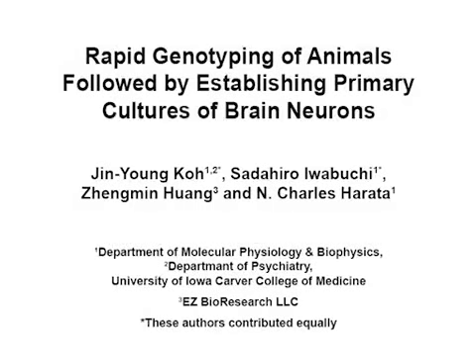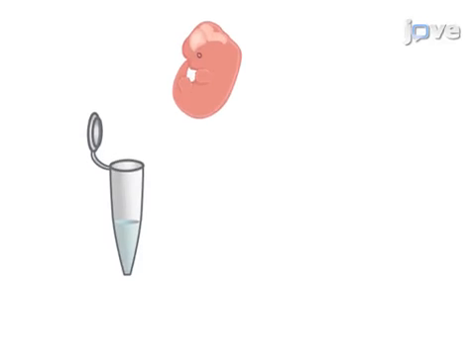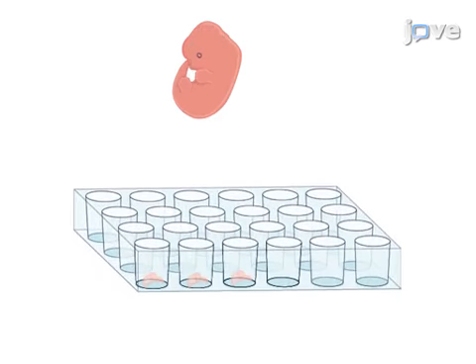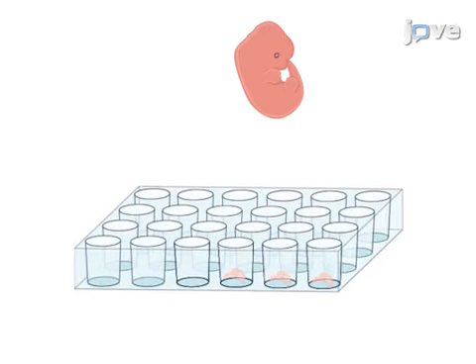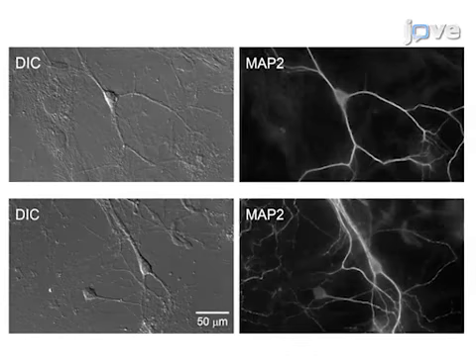The overall goal of this procedure is to genotype newborn mice and to generate low-density neuronal cultures on a glial feeder layer. This is accomplished by first rapidly genotyping newborn mice using their tail tips. On the same day, the brains are dissected and cultured as glial feeder layers. Then, after a few weeks, another group of newborn mice are rapidly genotyped, and neuronal cells are generated from the animal's brains for culture on the preceded glial feeder layers. Ultimately, this method can be used for rapid and reliable genotyping, as well as for the generation of healthy neurons and glial cells.